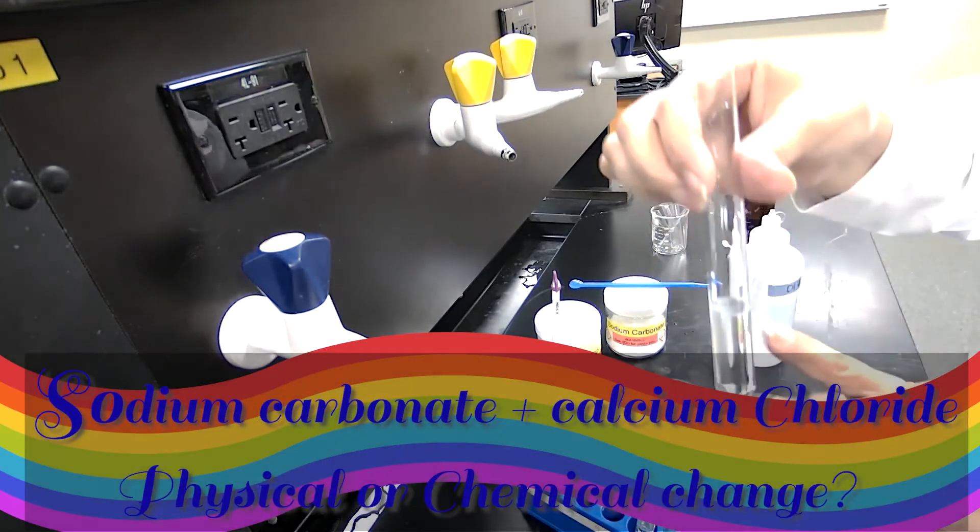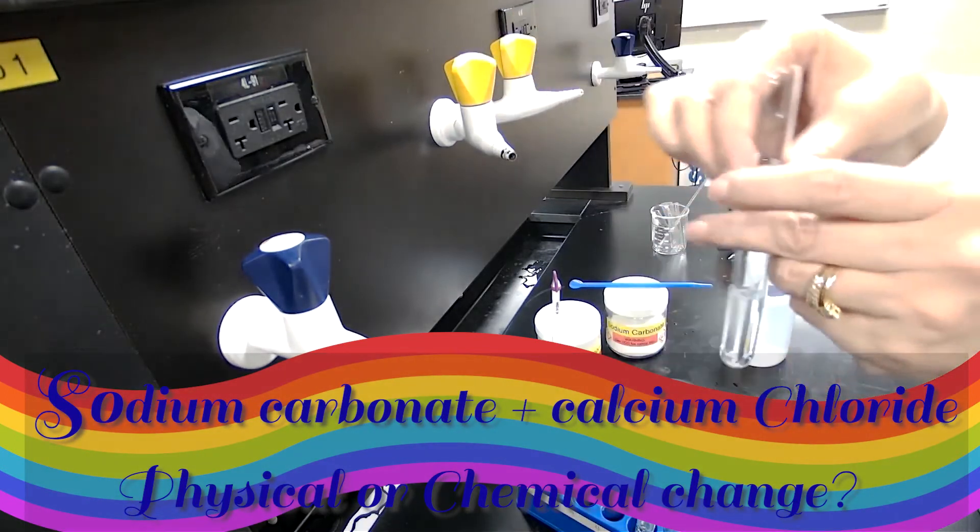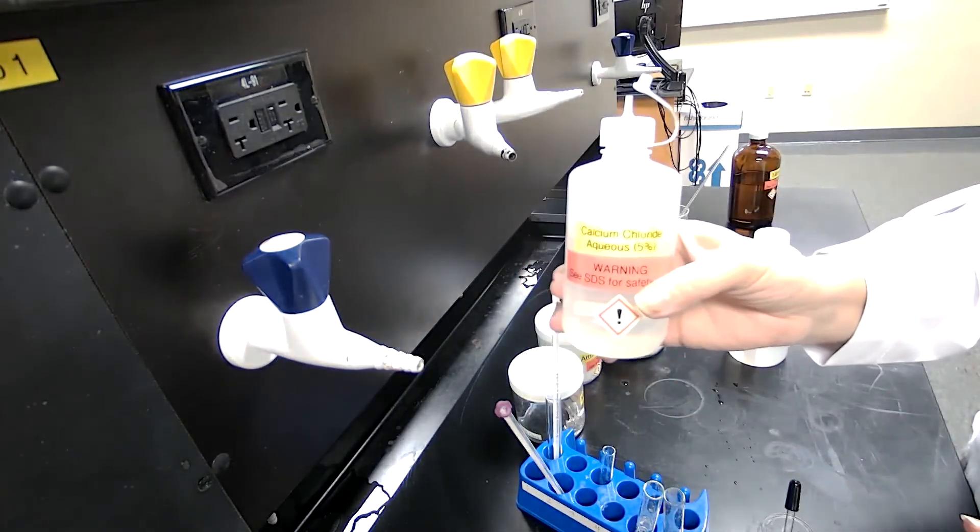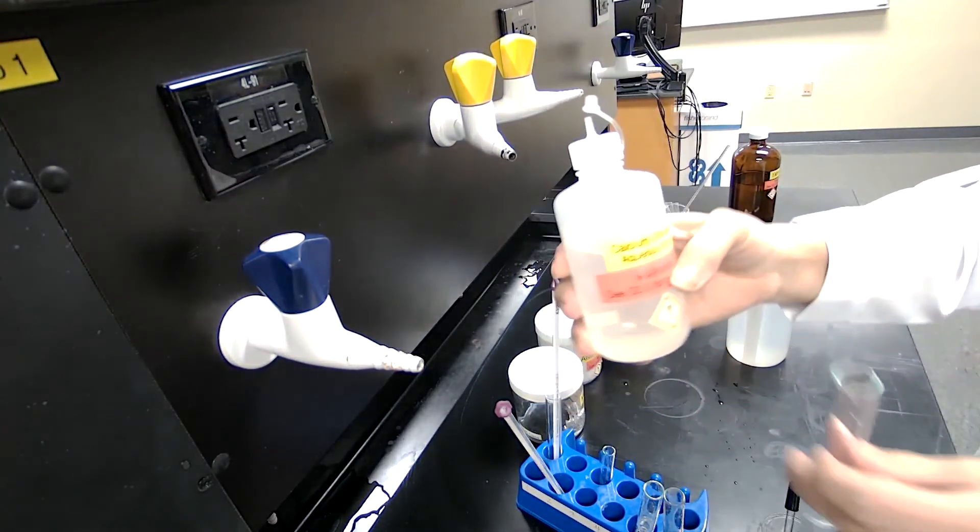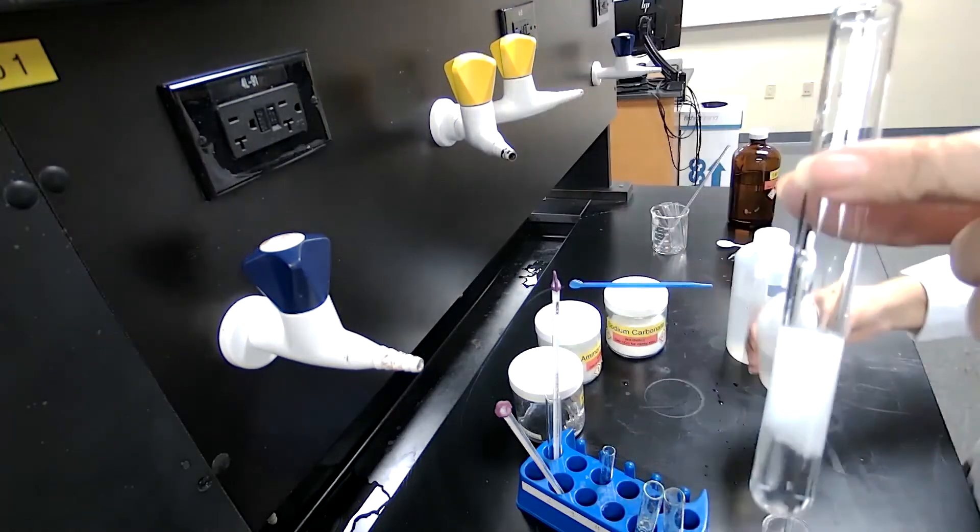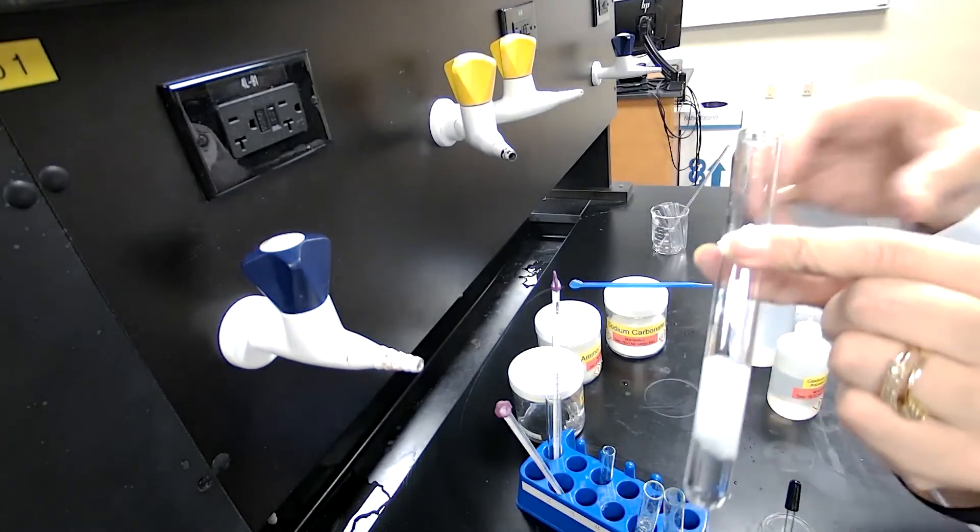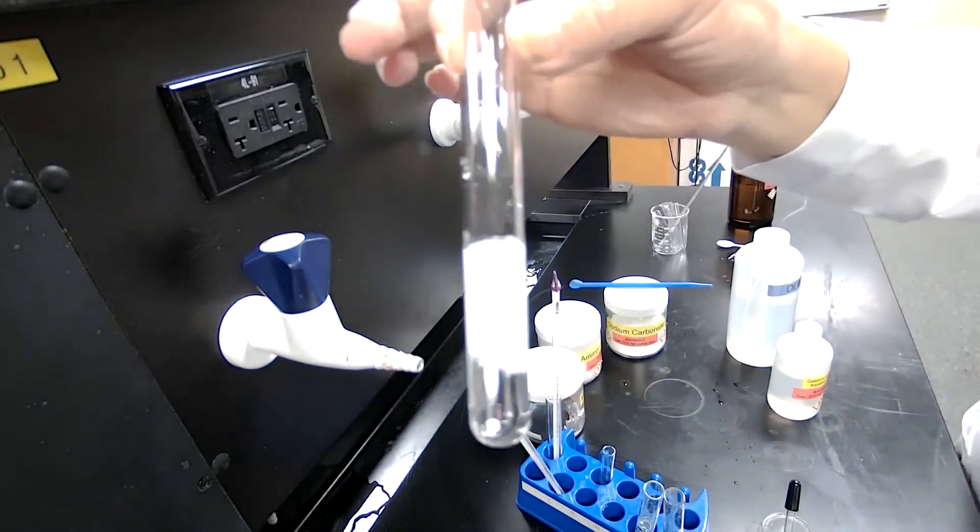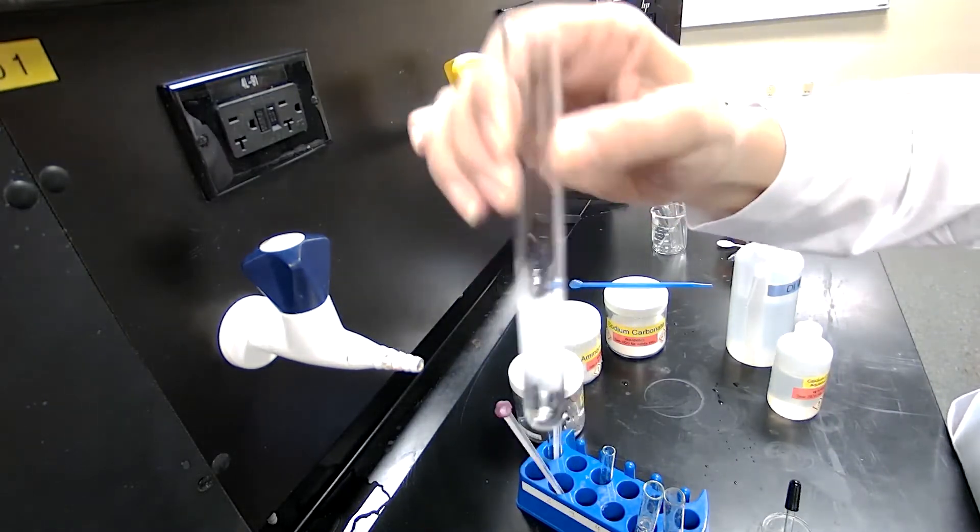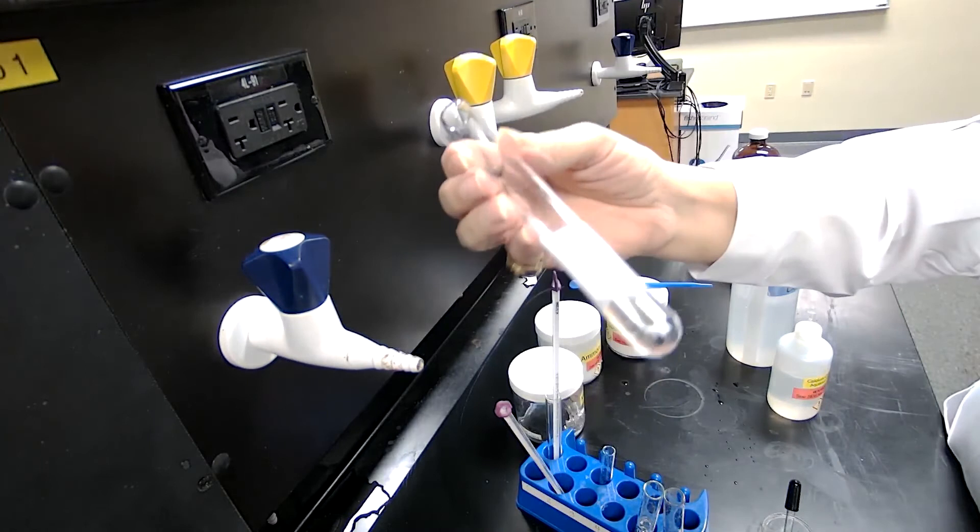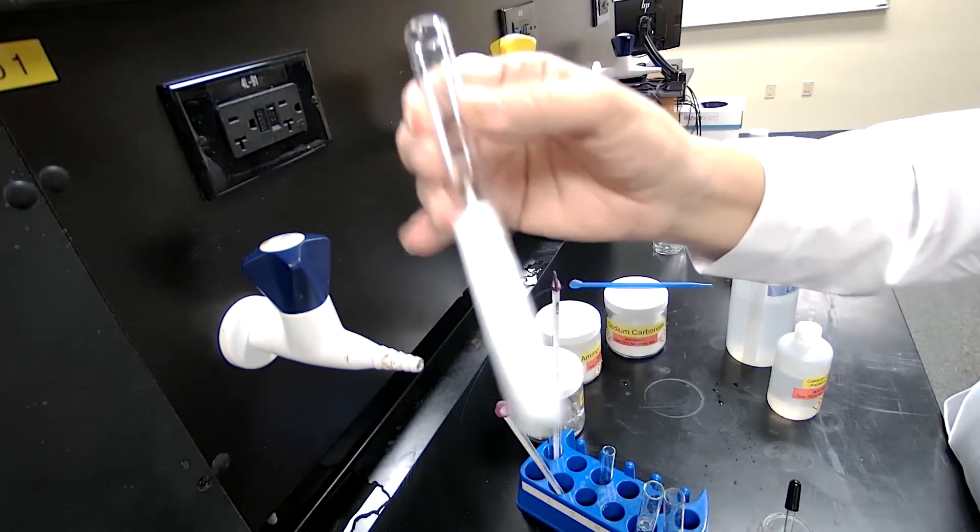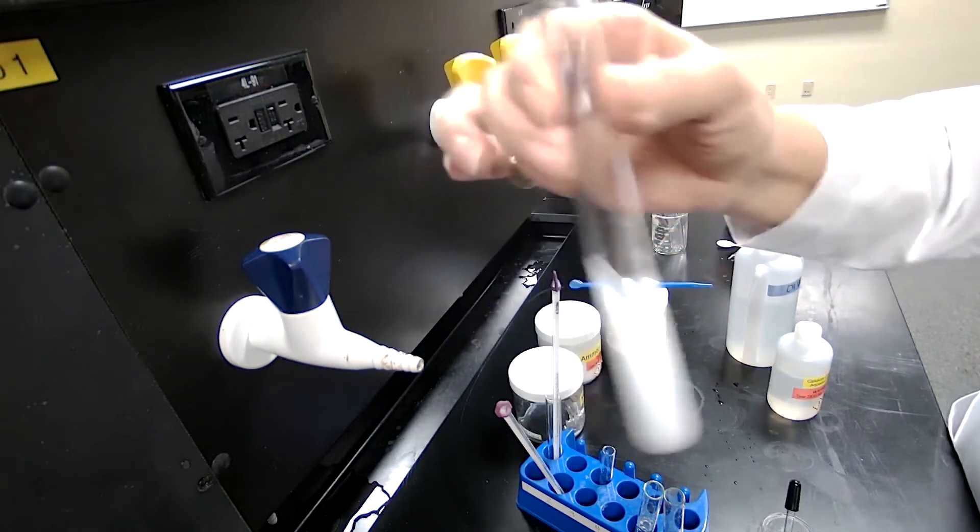To the second test tube, which is test tube B, we have a clear solution. The instruction is asking me to add calcium chloride. So I will take the calcium chloride and add it to the second solution. When I add calcium chloride to that, a white precipitate forms. It turns very cloudy and the white precipitate is forming.